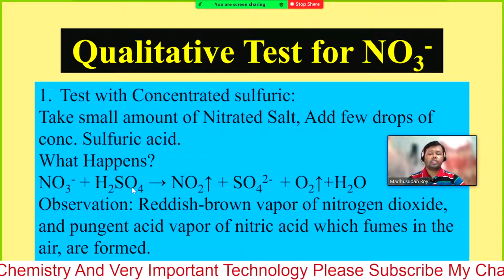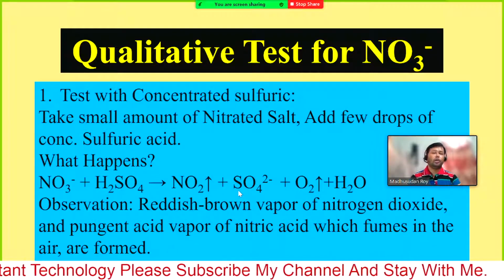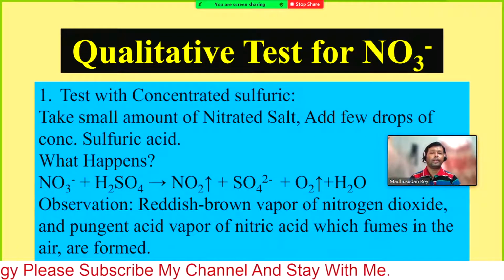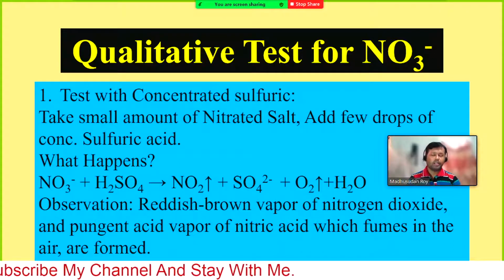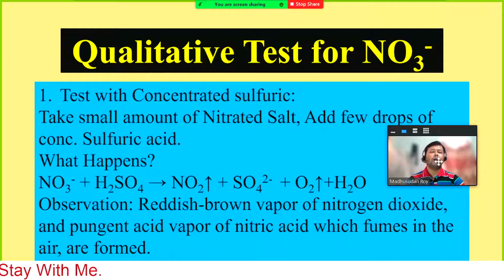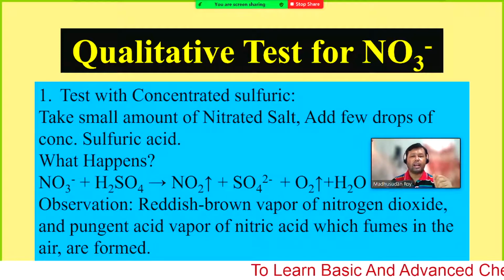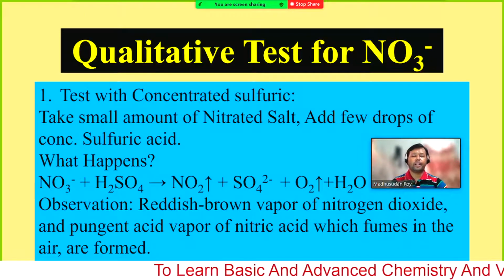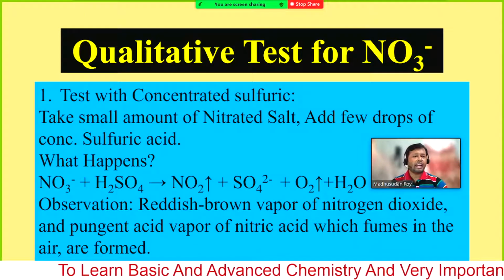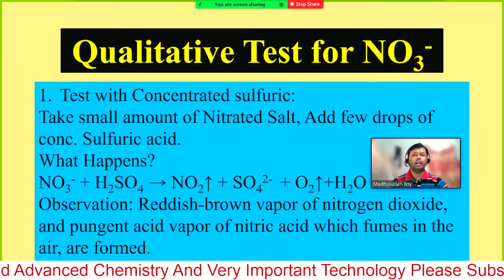You need to be careful when you are adding concentrated sulfuric acid. Always be careful. Concentrated sulfuric acid is quite dangerous. Never pipette by mouth. Always use a dropper or pipette filler to take the concentrated sulfuric acid, or any acid. Most of the acids are dangerous, so always try to follow the process.